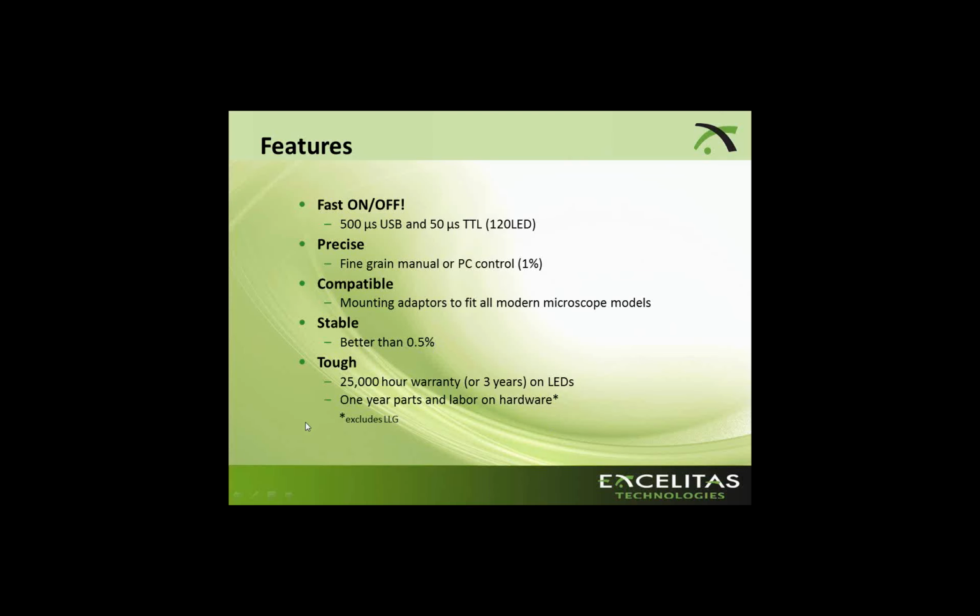So in summary, LEDs are best for stability, happy cells, long life, lack of consumables, lack of mercury for those who are moving toward more green technology, and fast on and off, as well as fast switching. Lamps, though, the purpose of this webinar is not to put down lamps, because lamps still have the maximum intensity for certain applications that require super high intensity.